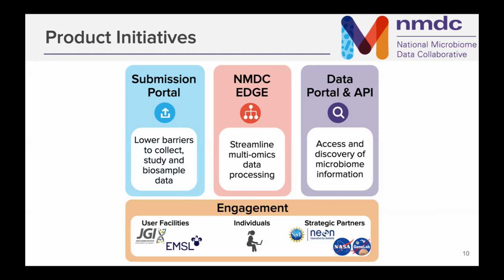So NMDC is like an overall package, like a pizza, where it has all the tools inside, and you don't have to select any of the tools. It just uses the best tools for this, and then you get your results at once.